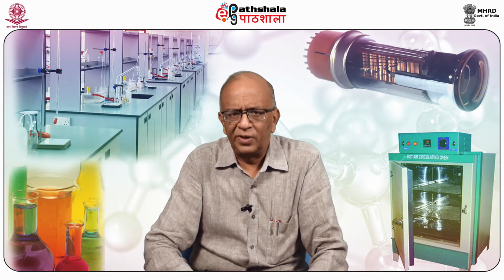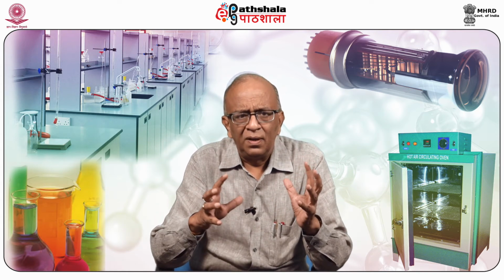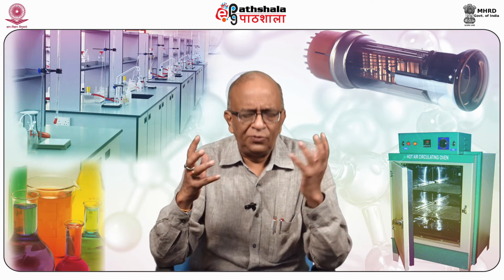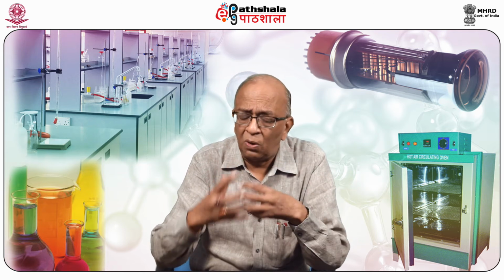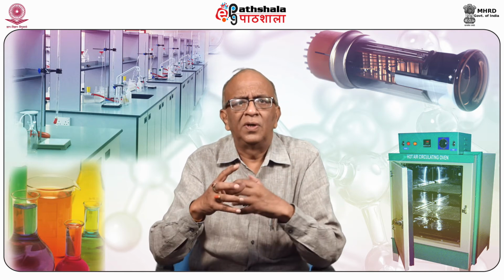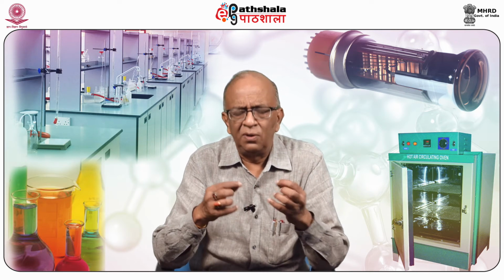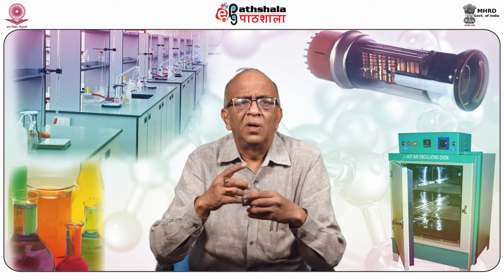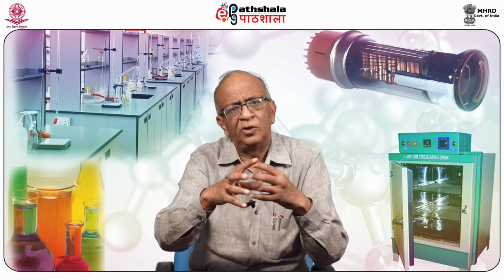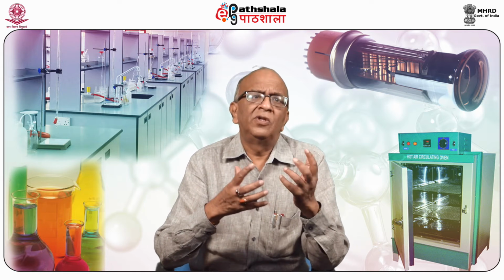Unlike other chromatographic techniques, gas liquid chromatography is a closed system. Here, the column remains in an oven which is maintained at a particular temperature. The sample is introduced into that column through a self-sealing silicon septum with the help of a micro syringe. The sample is taken in solution with the micro syringe, and the solution is injected through the self-sealing silicon septum into the column, which is placed in a closed oven maintained at a set temperature.